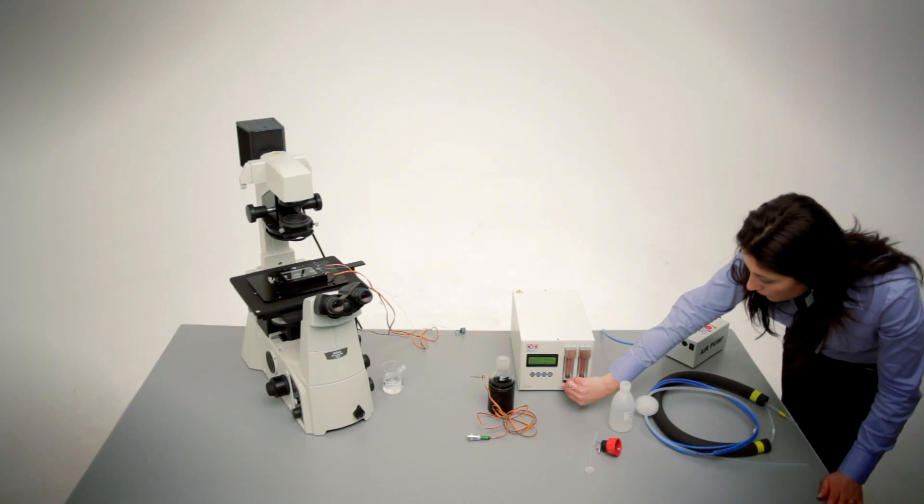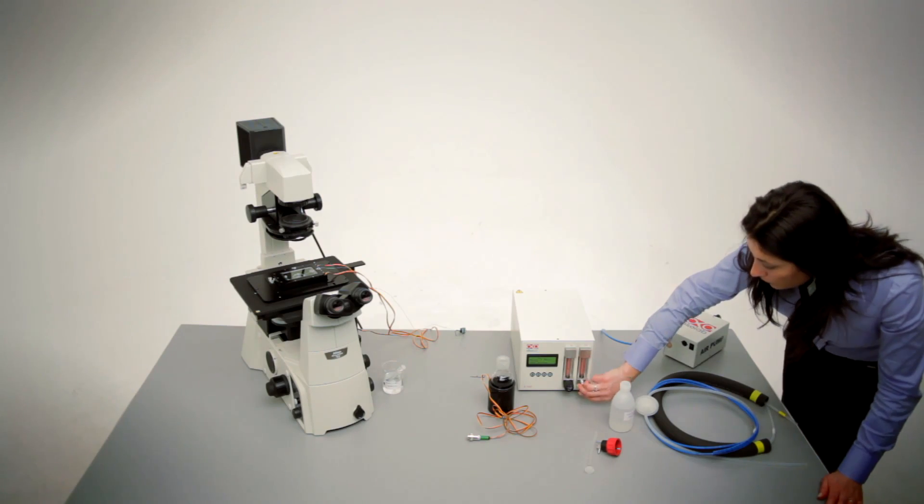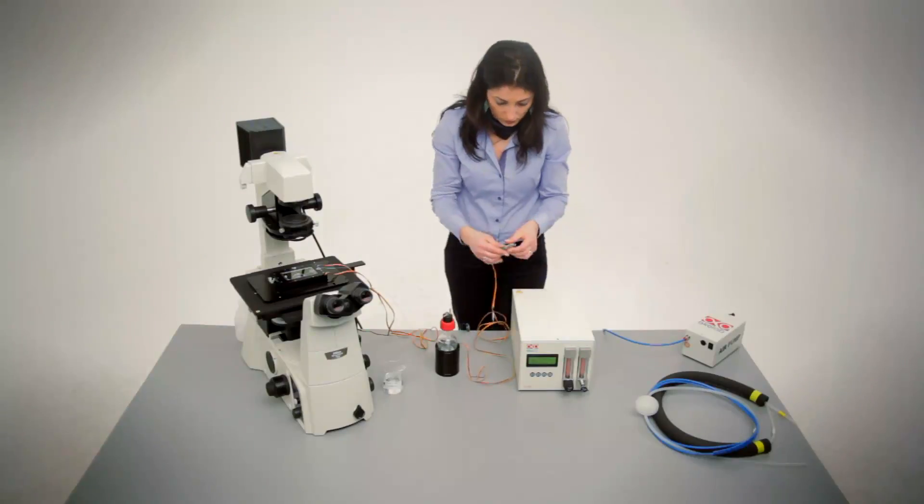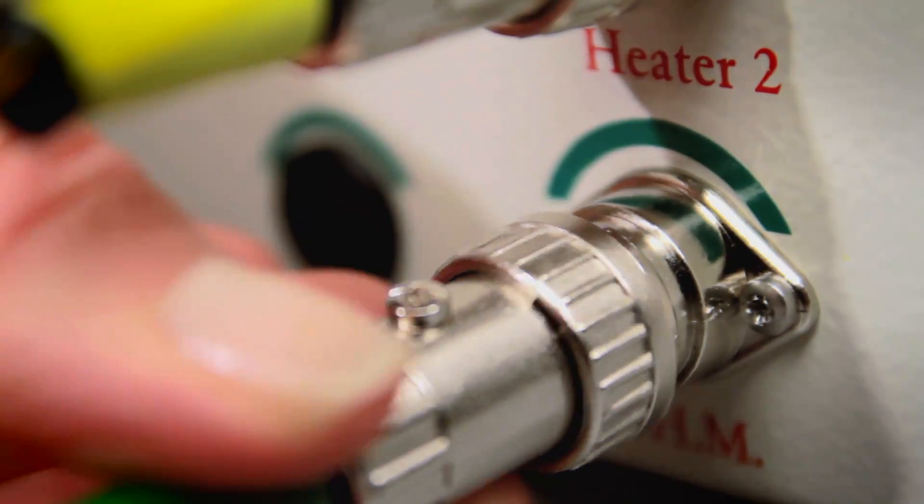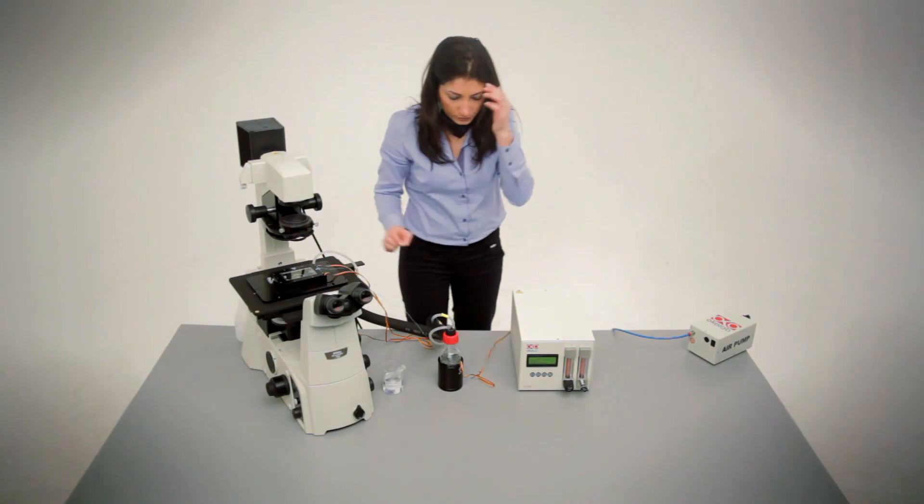Manual floating ball gas mixers allow to mix air and CO2 in the desired concentration. Before entering into the chamber, the gas is humidified by bubbling in temperature controlled water. The heating collar is attached and powered by the UNO controller.